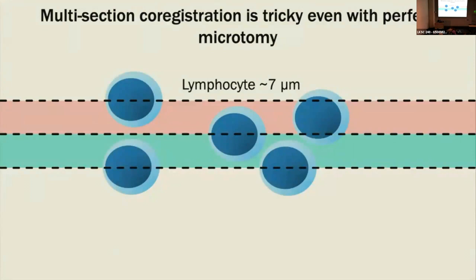And then usually when you do an initial fixation, that's to just harden up the tissue a little bit, so that you can cut it. Otherwise, if you're trying to cut raw tissue, it's kind of a mess, right? So after initial fixation, which is usually a few hours to harden up the tissue, then you cut it again into finer slices. When you cut it into finer slices, the individual slices should be no more than 3 millimeters thick or so.